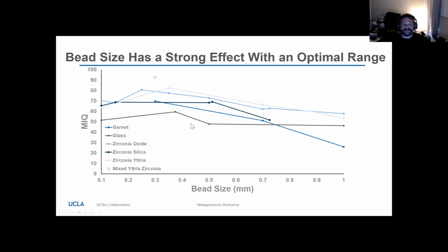And that bigger mass is going to give you a bigger kinetic energy in the end. So glass, not super performant. If we go up here, we see synthetic garnet, which is more dense than glass and harder than glass. Also, hardness probably makes a difference because if you have harder beads, you have less elastic collisions. So synthetic garnet, slightly better performance than glass.